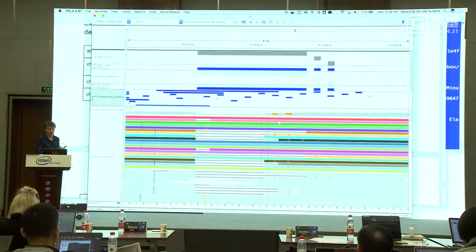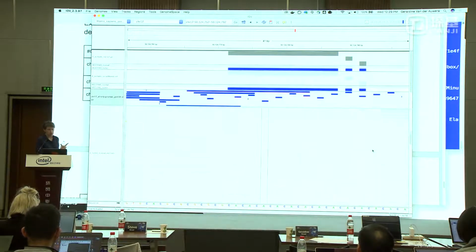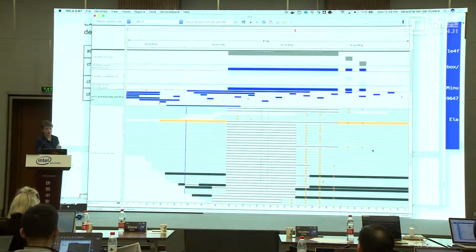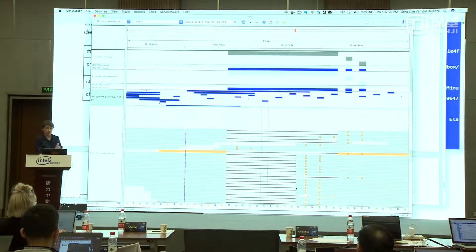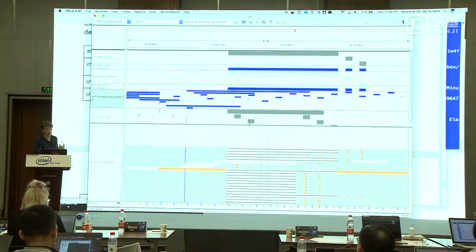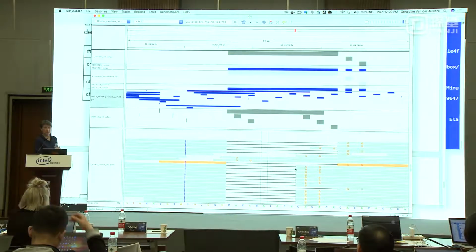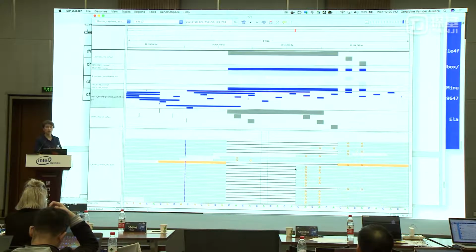There's a lot that's going on both in the normal itself and in the tumor BAM. The proximity of so many other events, other SNPs, things like that, the amount of things that have been reported in gnomAD as well, this makes us think that it's probably an artifact. It's more probably an artifact. And you can see it coming up in the panel of normals too. And so when you have this kind of complexity, it is a lot more likely that you have an artifact compared to a real somatic variant.